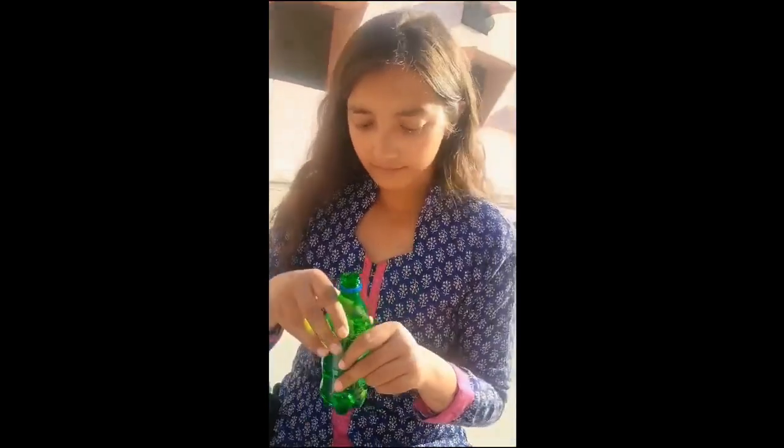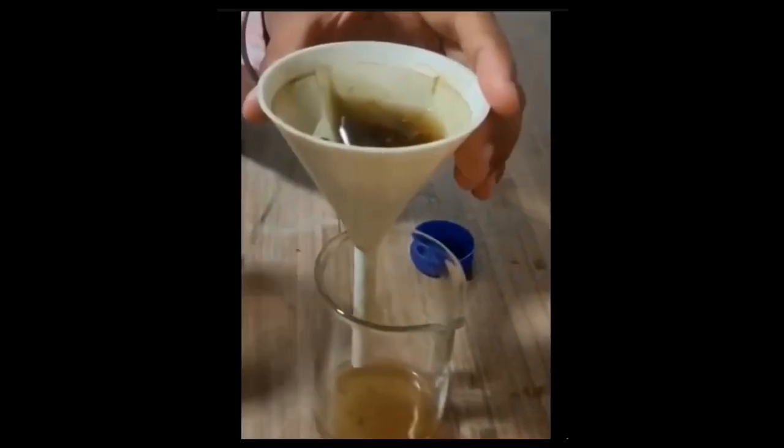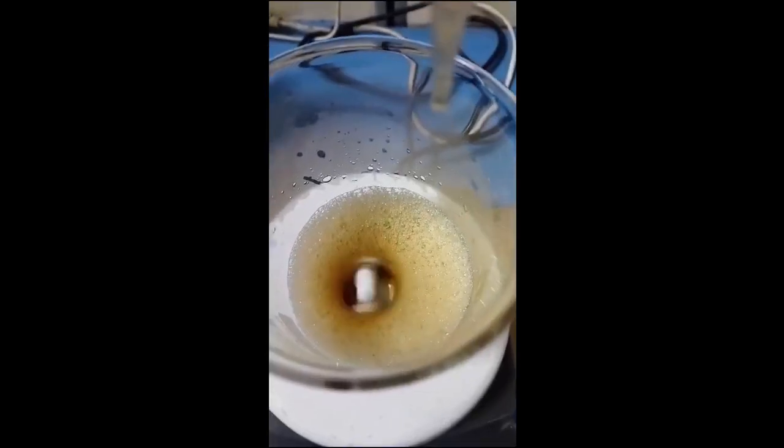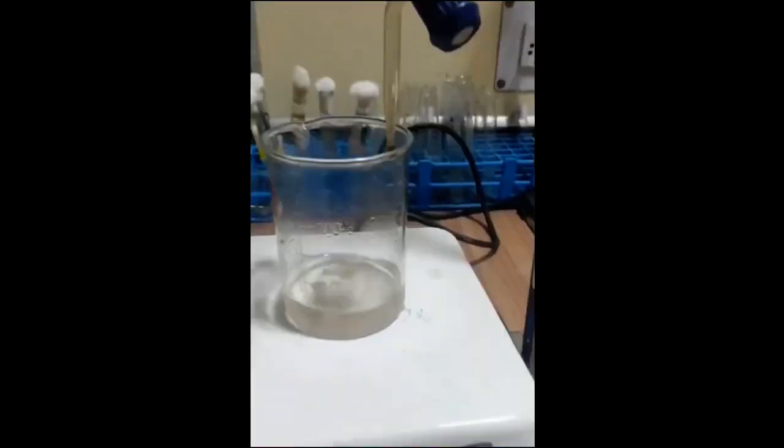Keep this extract for about 5 to 7 days, and now after 7 days we'll take this extract to the laboratory. Now in the lab, we'll filter our extract with Whatman 1 filter paper. After filtering, take 20 ml of aliquot in a beaker and add a few magnetic beads. Now set the magnetic stirrer to 60 degrees Celsius and 540 rpm.